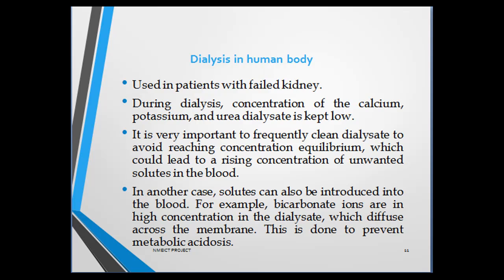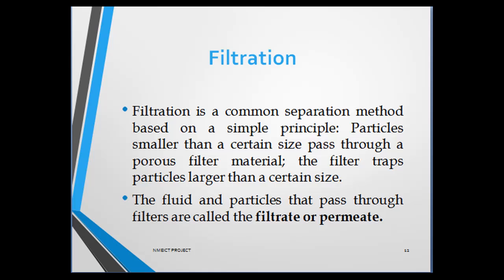The second type of separation technique is filtration. Filtration is a common separation method based on a simple principle. Particles smaller than a certain size pass through a porous filter material. The filter traps particles larger than a certain size. The fluid and the particles that pass through the filter are called the filtrate or permeate.